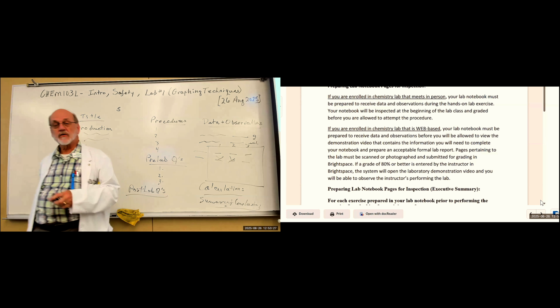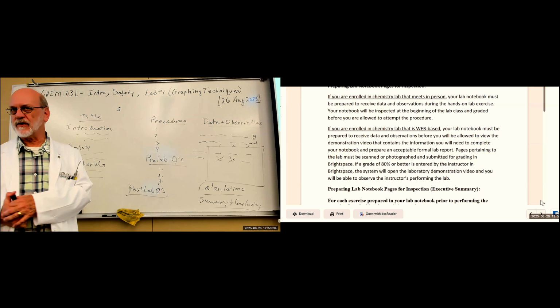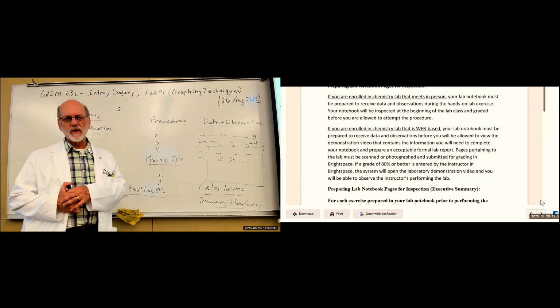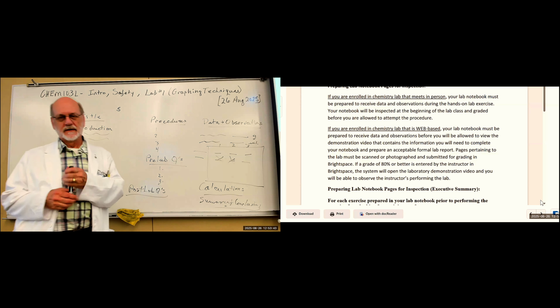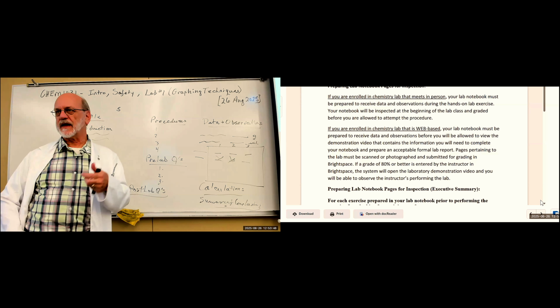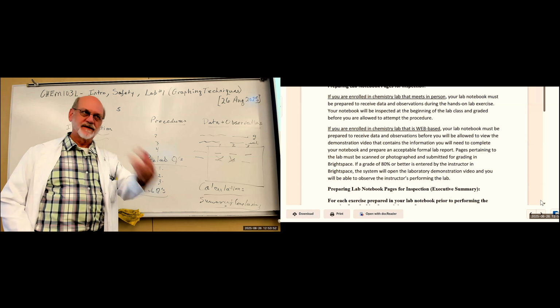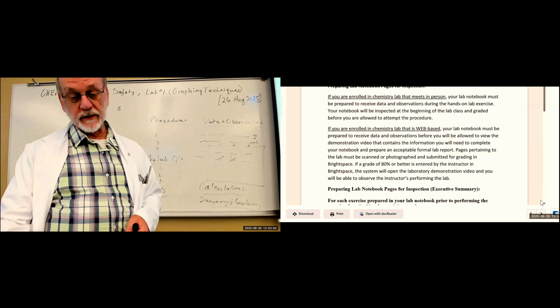Right? You need to know what you're going to do ahead of time because there are some chemical reactions that are violent, right? Extremely exothermic. We're not going to probably have, well, may not have any of those. We try to give students safe labs, especially for the first chemistry lab they've ever had. But you want to behave as if there are hazards and be especially careful. And that's the way you do it.